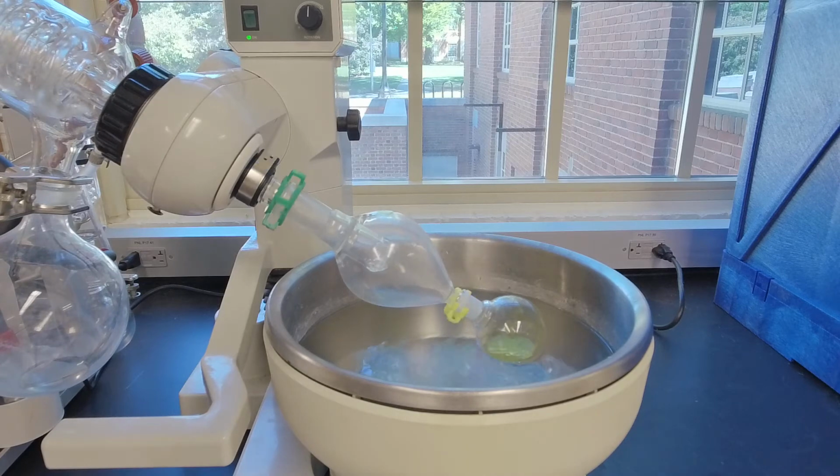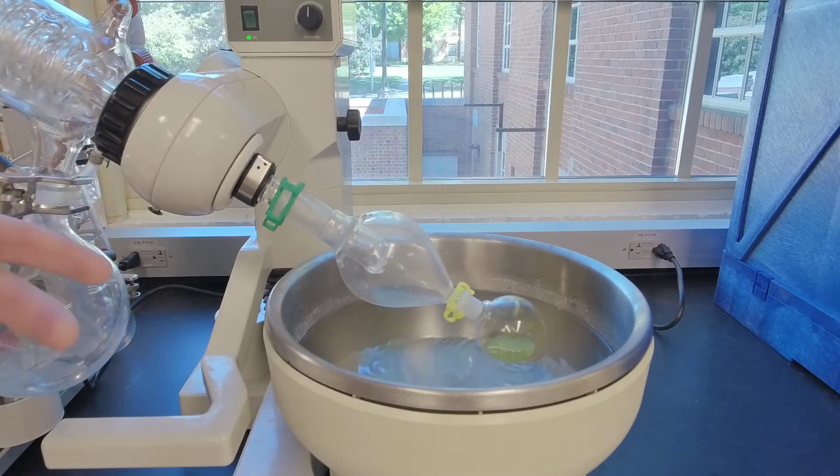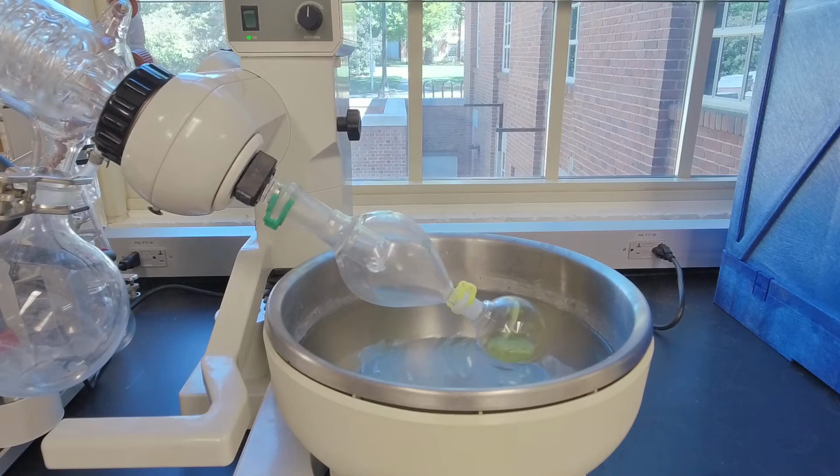Why are we spinning it? Well, by spinning it, you increase the effective surface area of the solution. And you guys should think about this: when something boils, it's molecules in the liquid state escaping to the gas state. To do that, they have to be at the air-liquid interface. And the more air-liquid interface you have, the faster the evaporation.